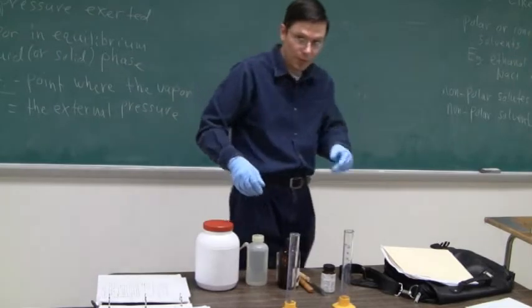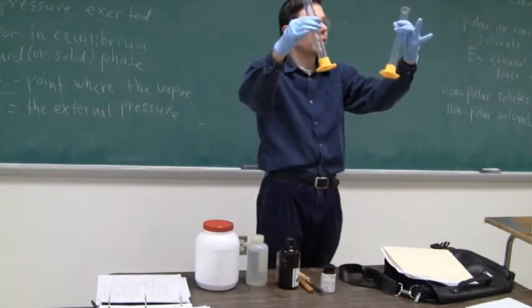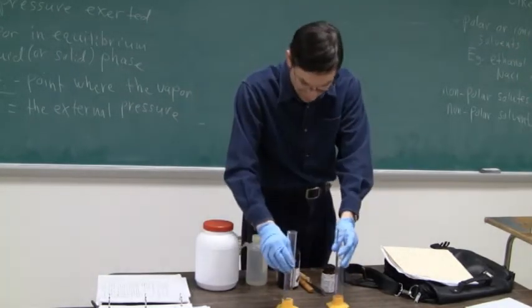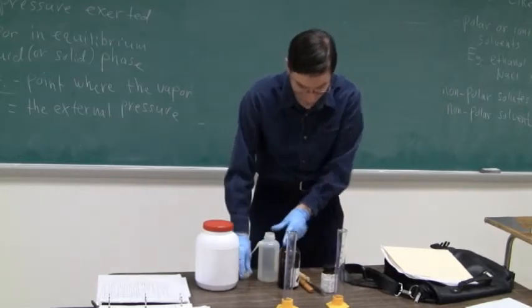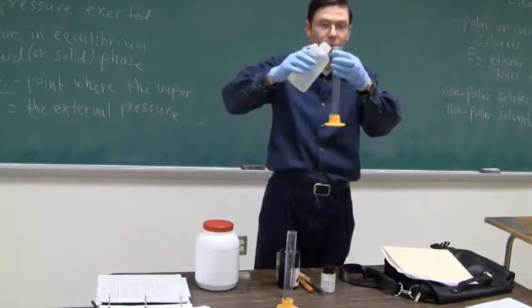All right, so all that I have here are two empty graduated cylinders, 100 milliliter ones, and I'm going to fill each one of them halfway with some water.